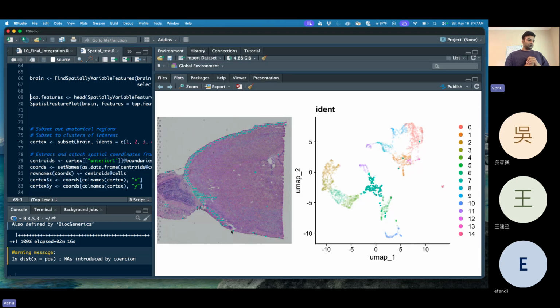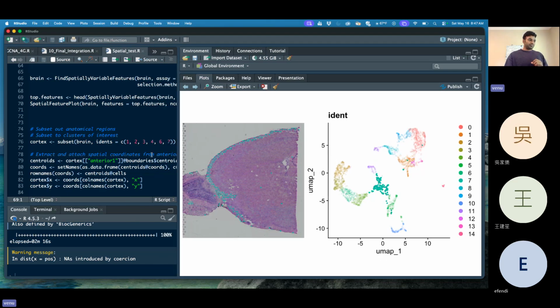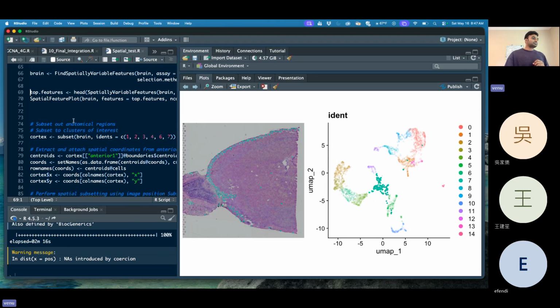With single cell it is easy. Each spot is nothing but a single cell, so you can easily get that all these cells belong to one group of cells. But with spatial, even if these are closely the same group, it is the same group of spots. Within the spots you have different cells, two to three different cells. So usually we go for two cells or three cells down.